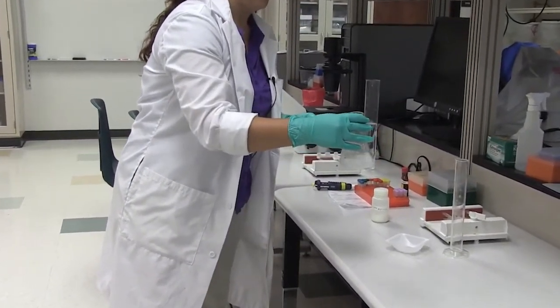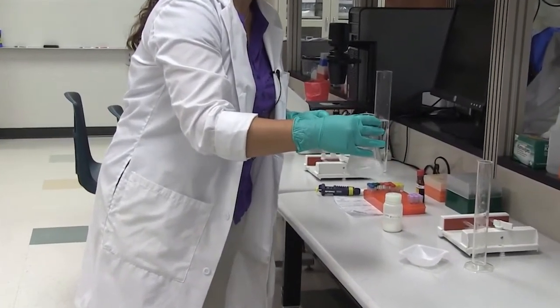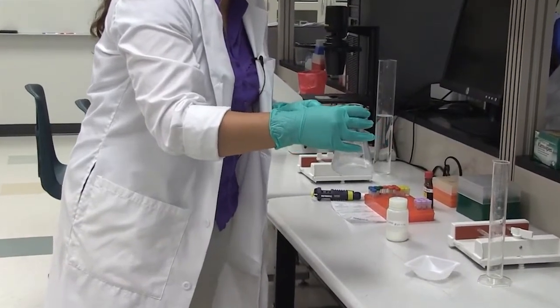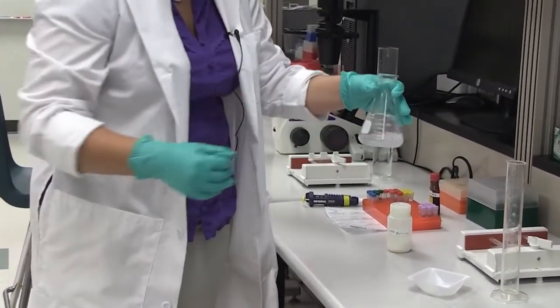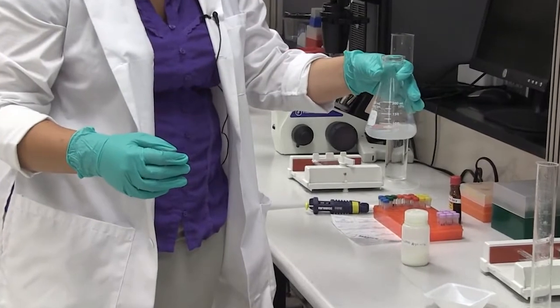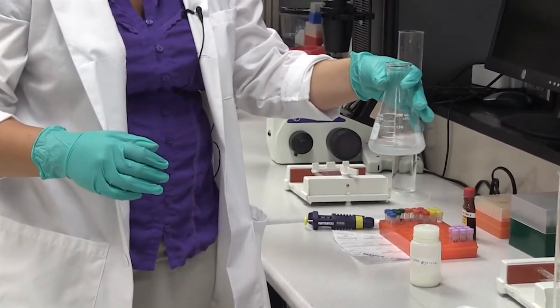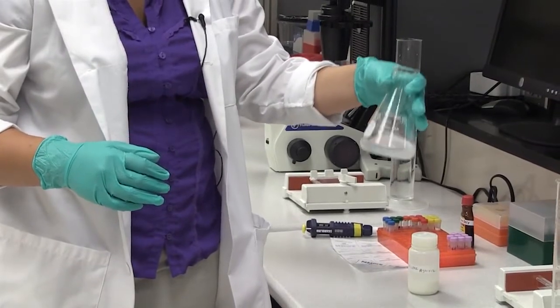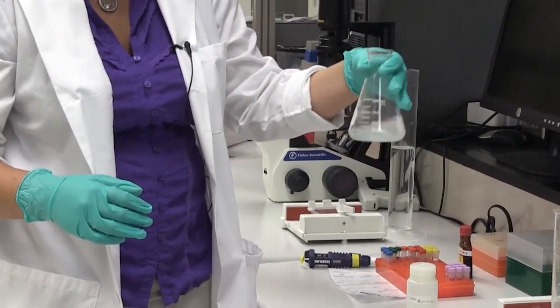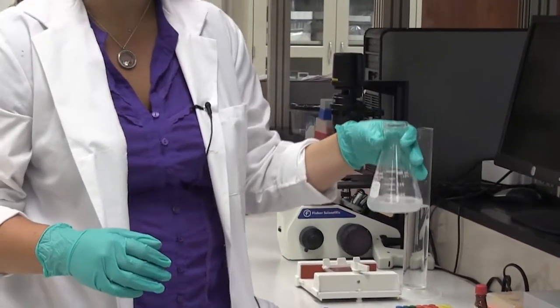Now that we have combined the agarose and the buffer, we need to let it hydrate for about a minute at room temperature. Then we're going to take it over to the microwave, add heat, swirl it twice during the minute time that it is being microwaved, and we will have a nice clear agarose that's ready to pour.